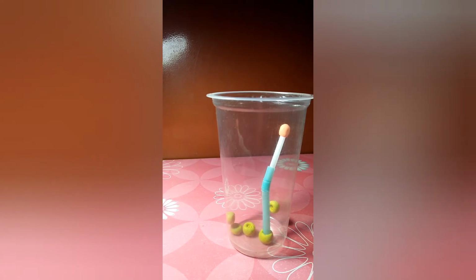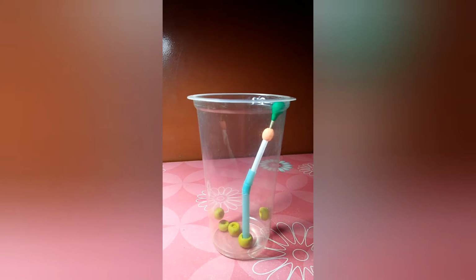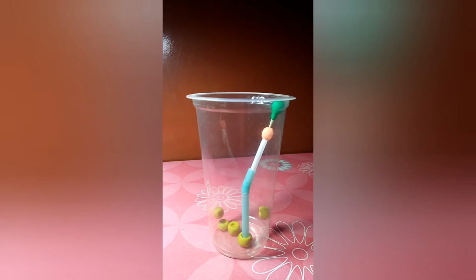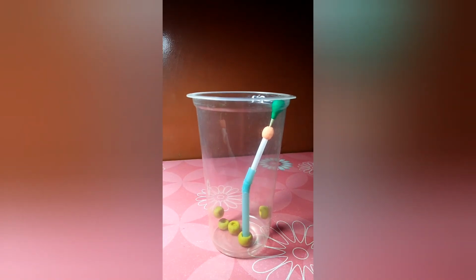The secondary antibody is conjugated with the enzyme. Now we'll add substrate because the enzyme interacts with the substrate to give a product, and due to the reaction of the enzyme with the substrate, it can change the color of the solution in the well. If no color is visible, it means that no antibody is present for the antigen we test for.